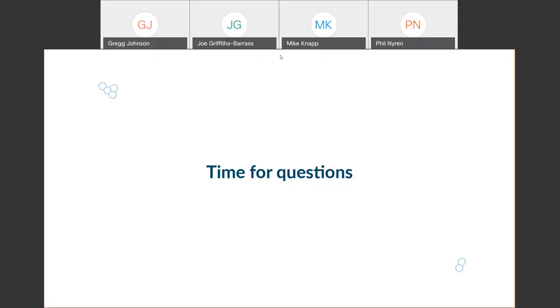No, I wouldn't say there's any inherent issues. Just something you need to be mindful of in terms of the flow range you're looking for. But I think, again, to back up a little bit, with the Masterflex peristaltic pumps, you're able to stack multiple heads on a single drive. Where you might have seen several images throughout the presentation with one pump head mounted on the front of a drive, imagine where you might have 2, 3, or even 4 pump heads mounted in sequence on the front of that drive.